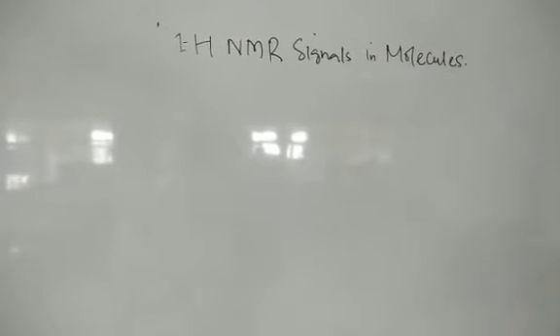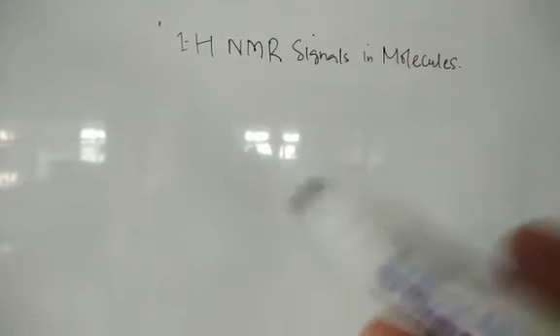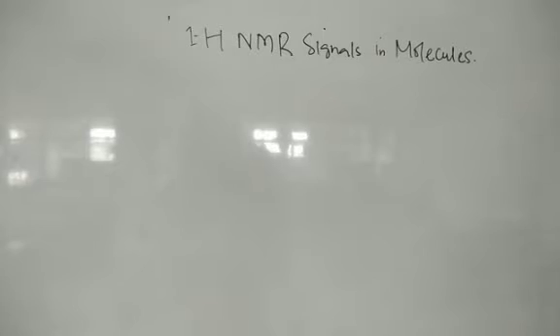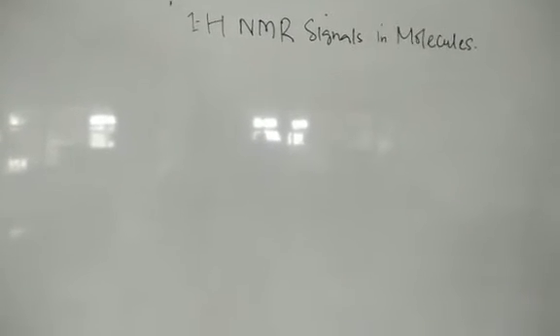तो आज हमारा जो क्लास है, so far as the NMR spectroscopy is concerned, it is the 1H NMR signals. Last class में हमने कुछ molecules को लिया था and then we tried to understand how many types of signals a molecule will give in the NMR spectrum. उसके बाद में we started with, उसमें थोड़ा ये भी हम कंसिडर कर रहे थे कि छोटे मोटे अंदाज में कि उस सिग्नल एक NMR स्पेक्ट्रम में कौन से साइड में आएगी, whether शील्डेड और डिशील्डेड.